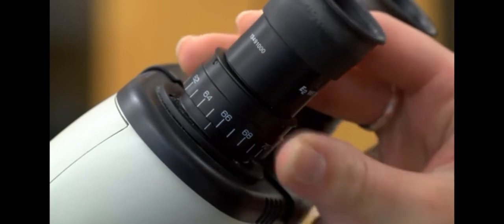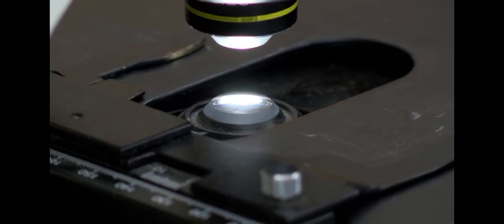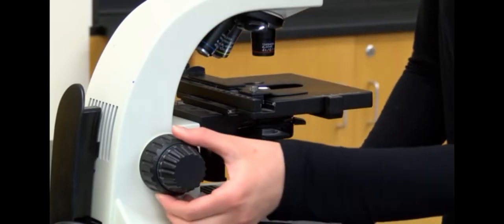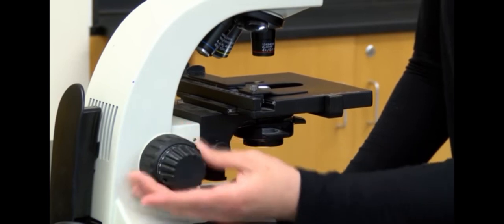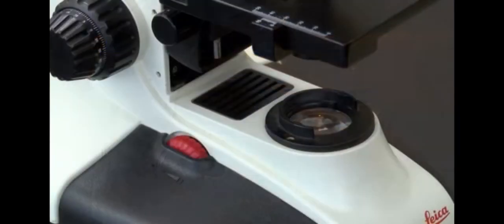Third, rotate the nosepiece so that the 10x objective is in operating position. You should feel a definite position stop for the objective. Turn the nosepiece clockwise and counterclockwise until you are familiar with this position stop.